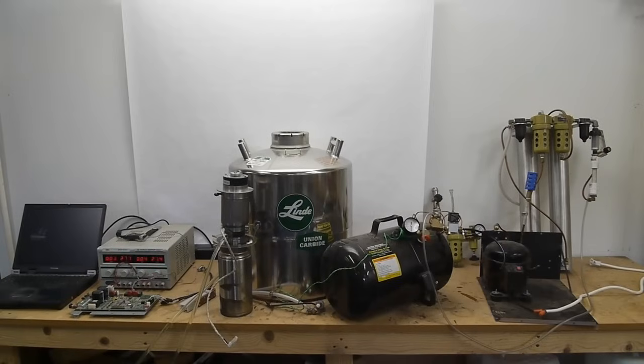The parts from left to right are a laptop to control the whole system, a circuit board to control the cryo cooler along with a bench power supply, and then we have the cryo cooler itself sitting on top of a stainless steel thermos in front of a much larger thermos called a dewar with the Lindy sticker on it.